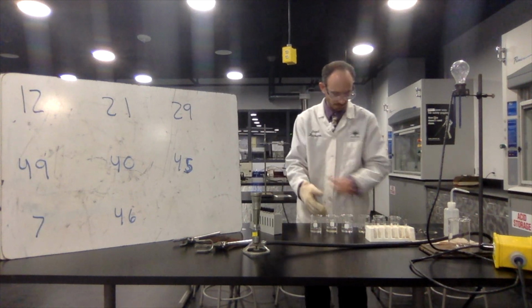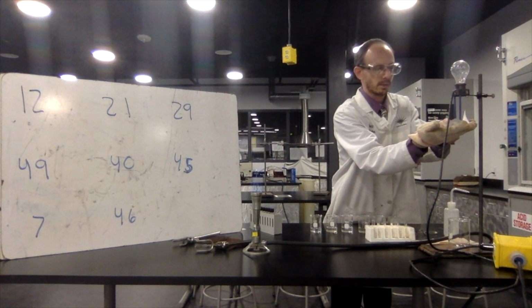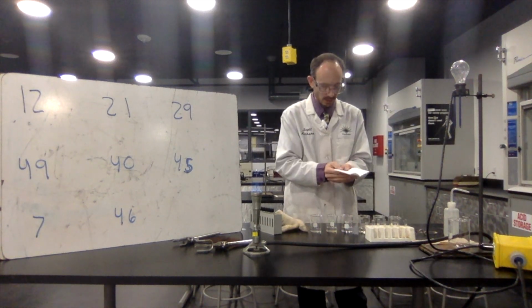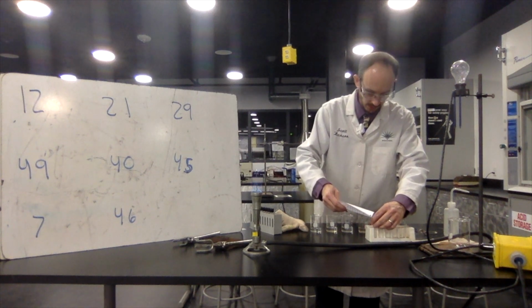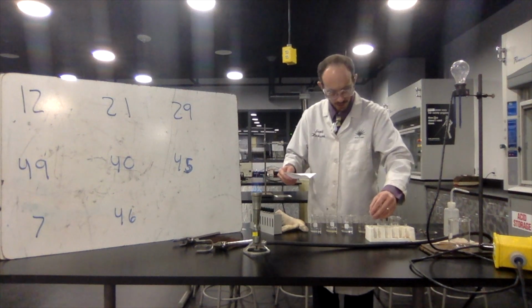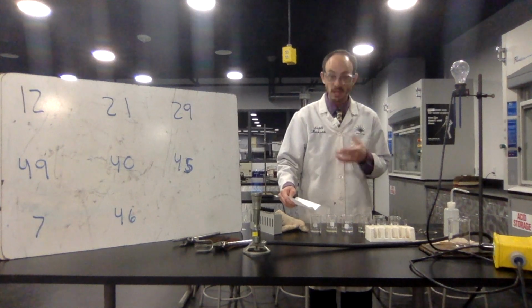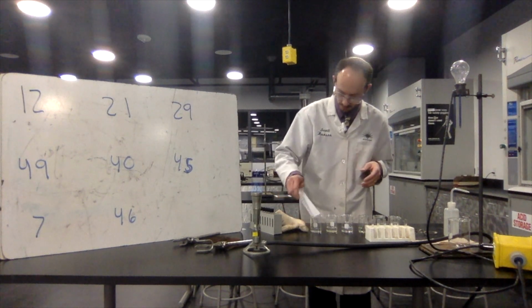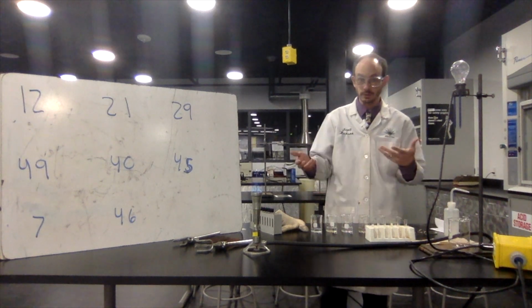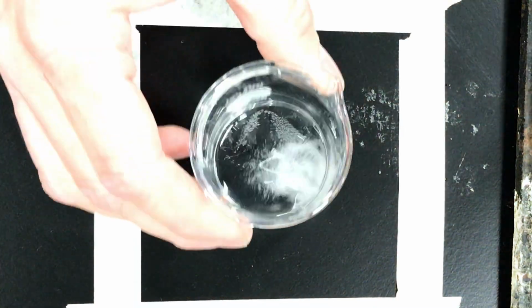Put on my glove. Test electrical conductivity. There is none. And I know what you're saying right now. You're saying, but Mr. Hansen, how can we test electrical conductivity if we don't have a solid chunk of it? Okay? And the answer to that is, as long as the particles have contact, we can see in the sea of electrons those electrons flowing. Since the only real test that we are doing with or for electrical conductivity is to see if it has that metallic characteristic.